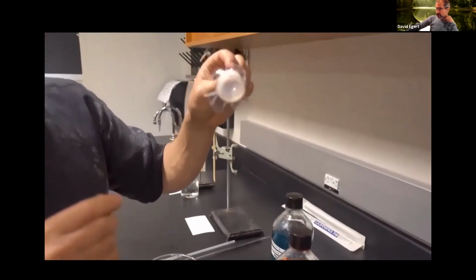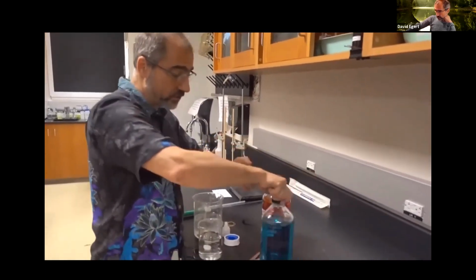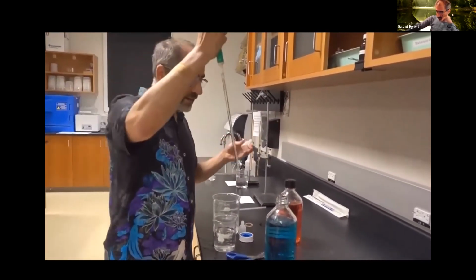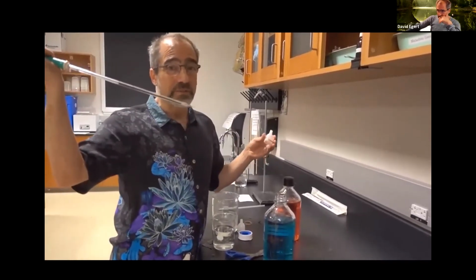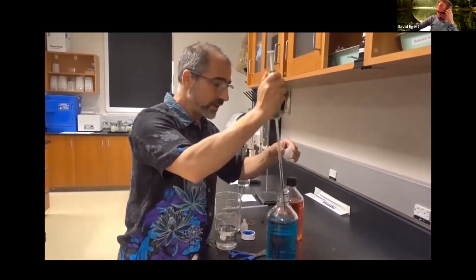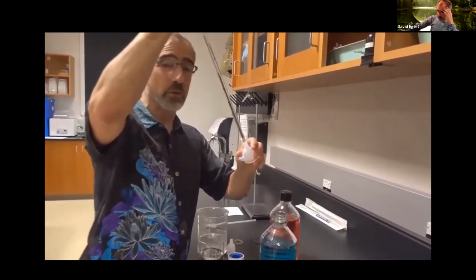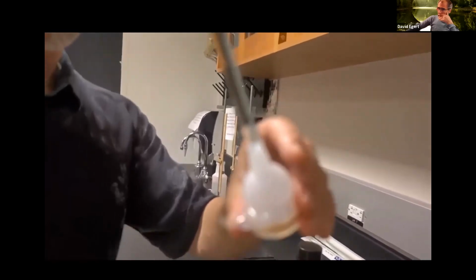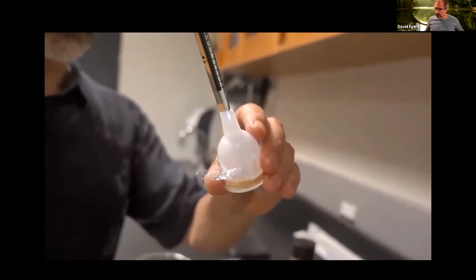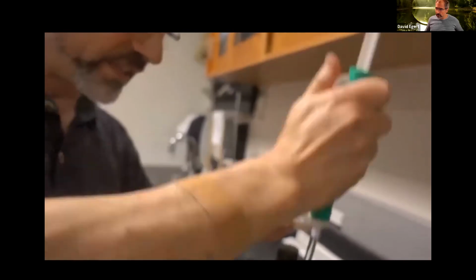Now I need to put my sugar solution in here, and that's easy to just do with the pipette. Our old friend, the pipette. Here, the volume action is more just an instrument to get it into the little hole here. You can suck it up. As you put the tip of the pipette in here, you don't want to push it all the way down because you're going to basically create a vacuum and you're not going to be able to have the sugar water go in because the air is going to block it. So I'm going to start filling this thing.